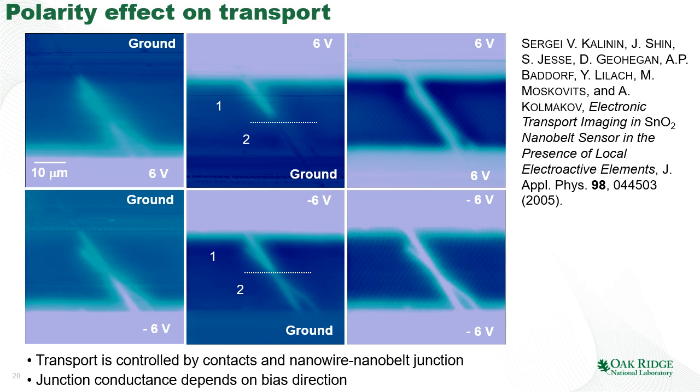And this polarity depends on the direction of the current. If I apply bias both to the positive and negative electrode, top and bottom electrode, I see that the nanowire is uniformly biased. Now, one very important thing here is that in this measurement, it's also extremely important to ground the bottom electrode, because if I don't ground the bottom electrode, I will see the uniform potential everywhere. So I really need to have the positive bias here, say whatever bias here, and I need to have a ground on the silicon that goes below the whole setup.